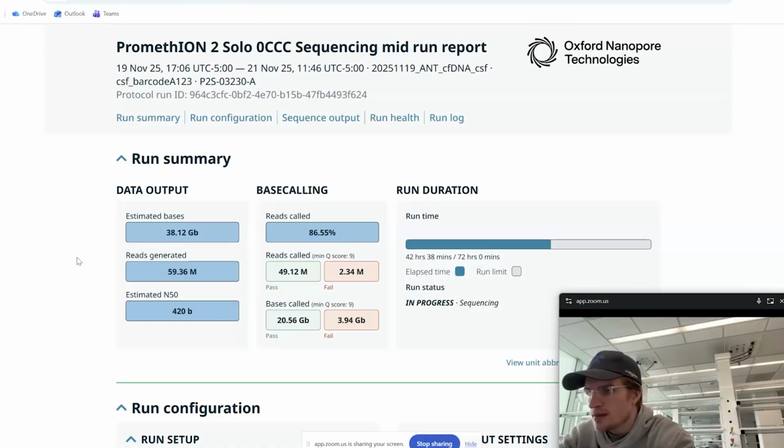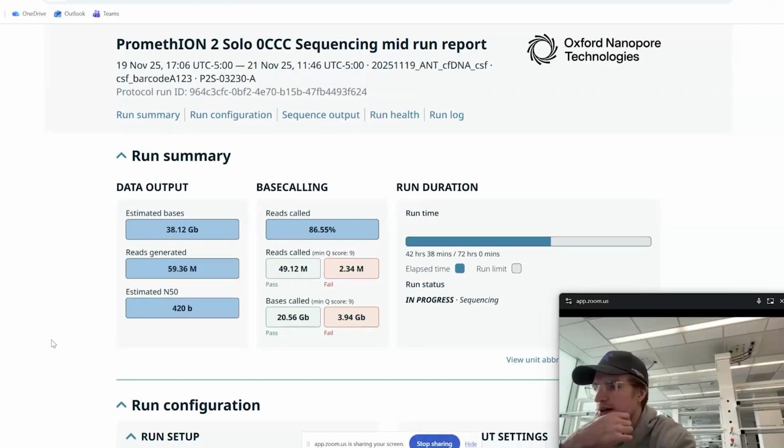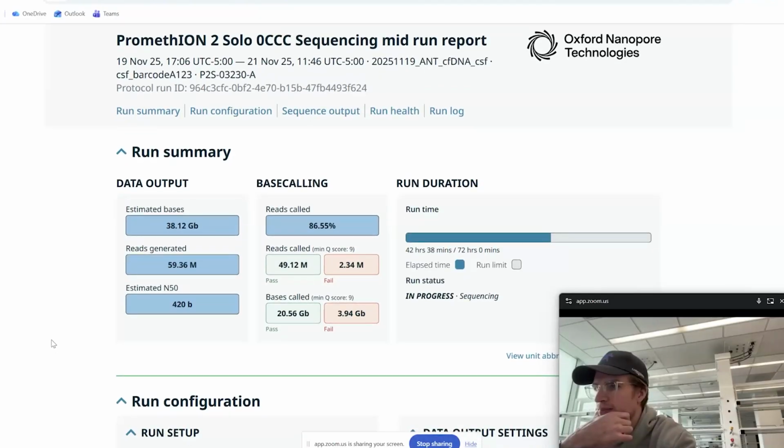My first knee-jerk reaction is that it justifies running the super accuracy on everything because of how small it is. I don't know if there's further consideration, but given that we're not working with that large of data for this particular run, seems like why not?